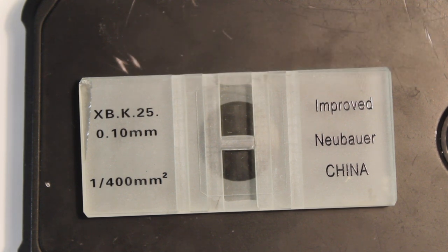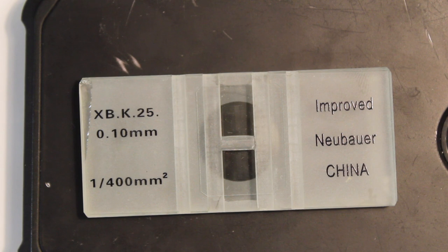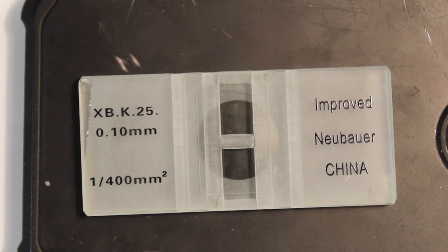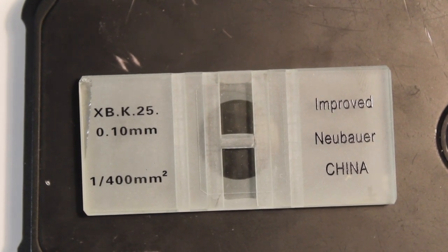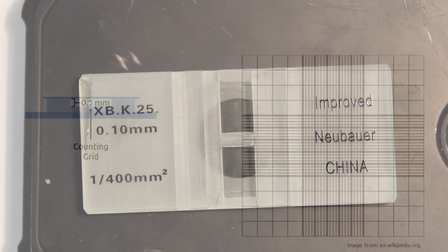In fact the only difference between a clinical grade unit and a unit like this is in a clinical grade unit both the coverslip and the hemocytometer are simply ground to much finer tolerances. For a budget unit like this they just run it through a basic machine and there is no post measuring to ensure that it conforms to the required depth. But like I said I've used a number of these and they're all typically within 3% of what you would expect with a clinical grade unit.